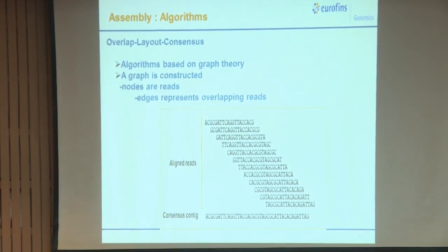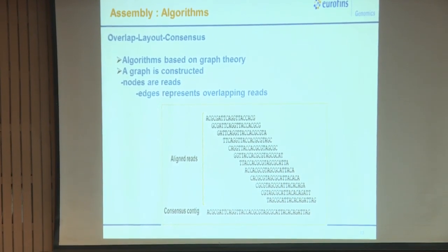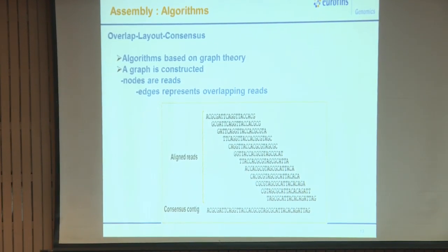When we talk about 5 GB, it is some millions of sequences, right. Each and every sequence finds an overlap with that first sequence, and that overlap is getting built up. Just imagine the capacity which is required to find these overlaps. And once this overlap is found, we have a consensus sequence, this is how a contig is formed. This is one of the methods.